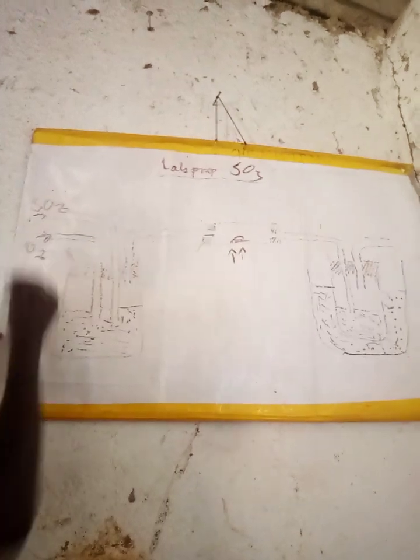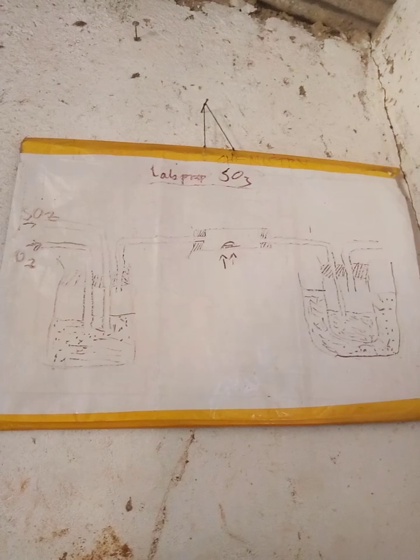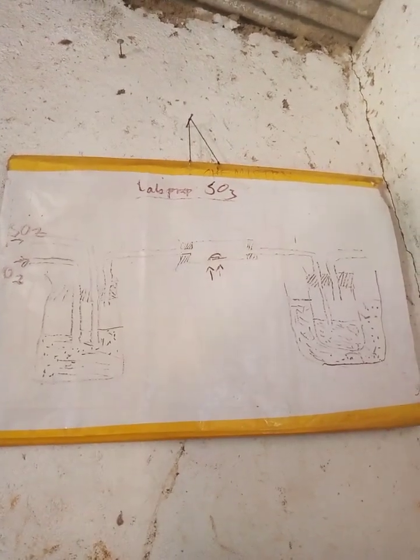As you can see here, we have sulfur oxide, and here we have oxygen entering in.